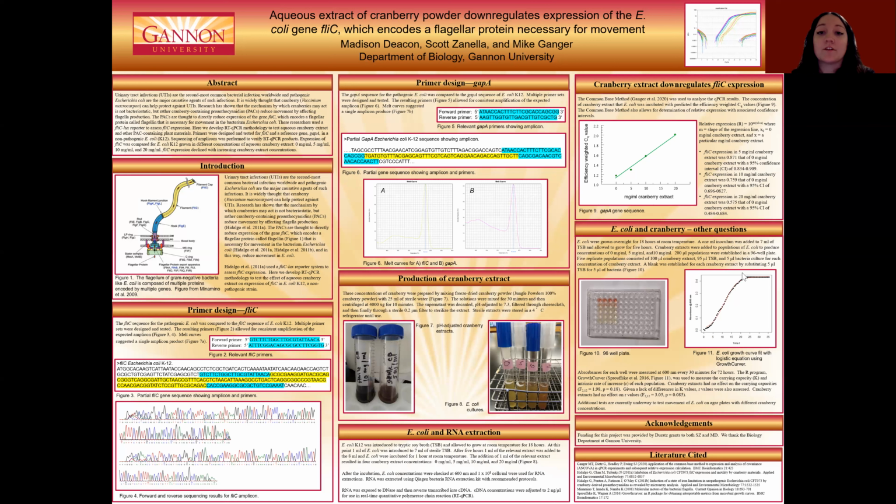And currently, we are also running tests on agar plates with different cranberry concentrations in order to see the movement of E. coli and how it is affected at each concentration of cranberry.